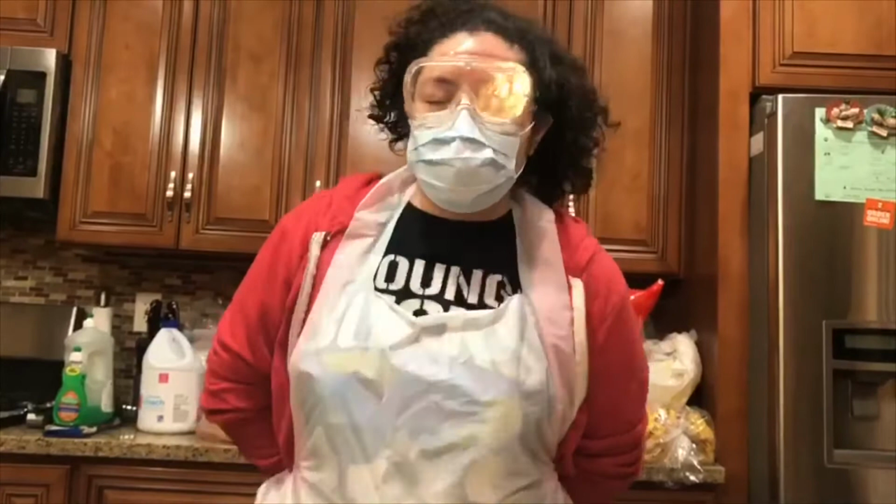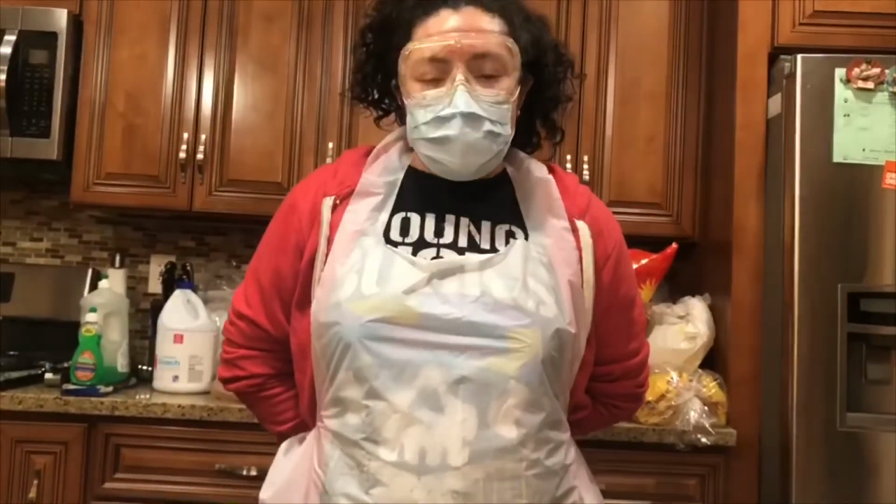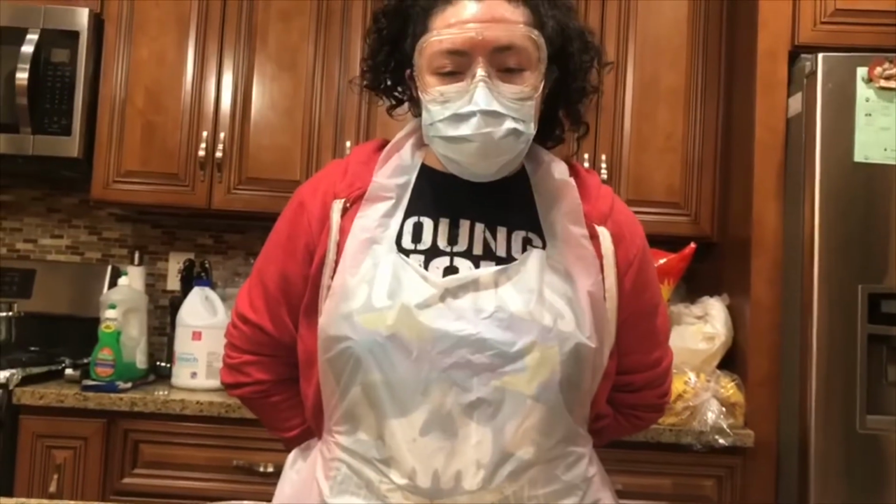Thank you. My name is Kelly Madrid. Today's date is December 14, 2019, and this is week 7 lab video. The Kirby Bauer diffusion test, still part 1 preparation.